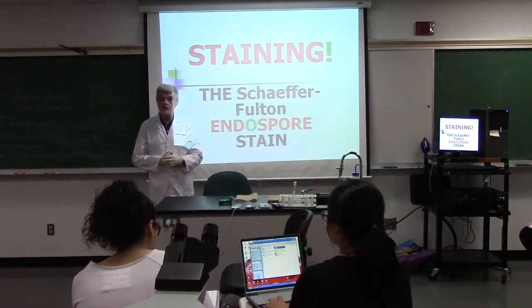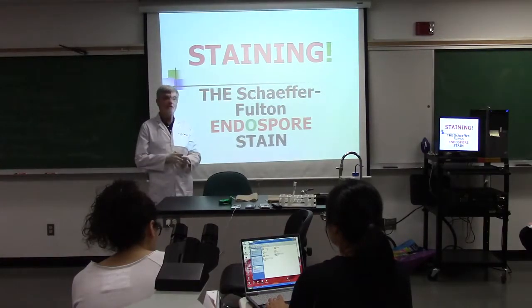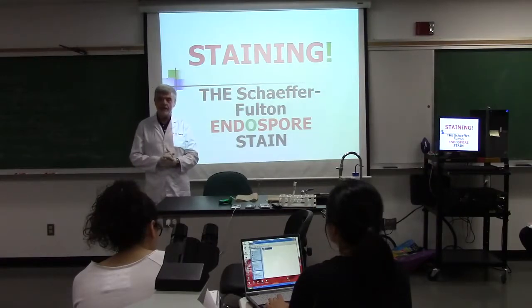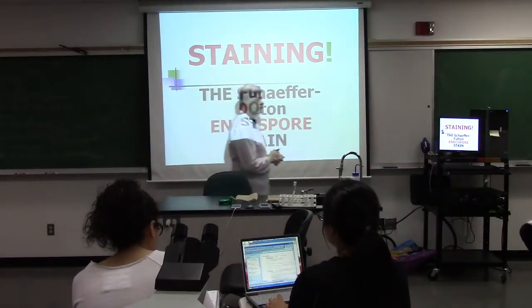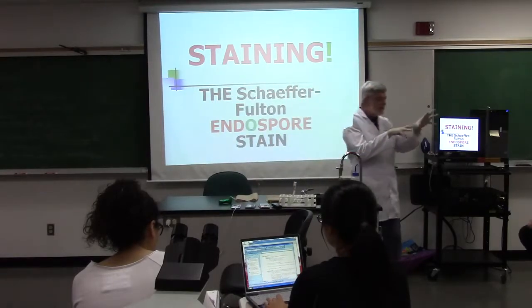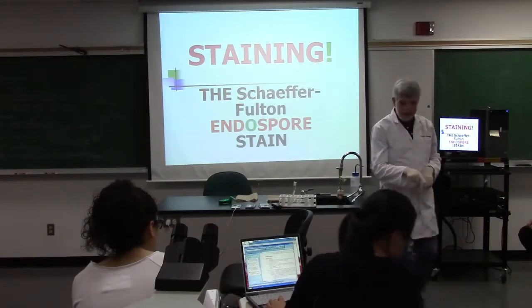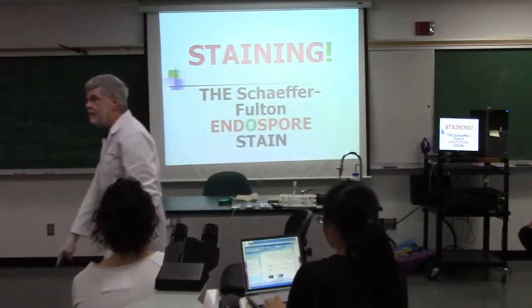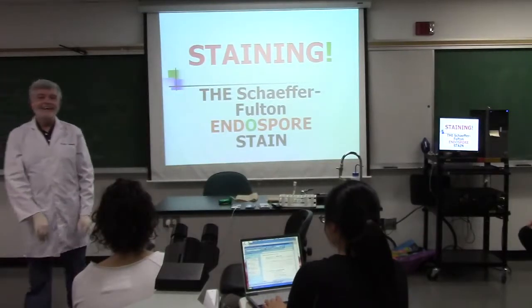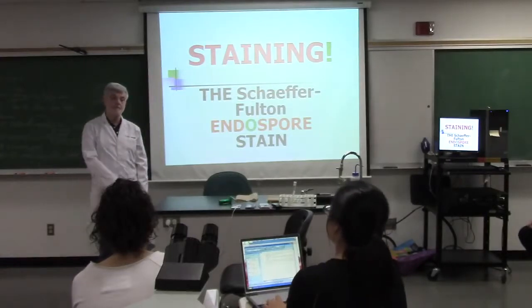You're going to have to be extremely cautious on this one, not to overcook it, because malachite green is evil. It's like an evil person. It spreads its evil everywhere. Look on the floor here, and you will rarely see anything except malachite green. One drop of it can be walked all over campus.